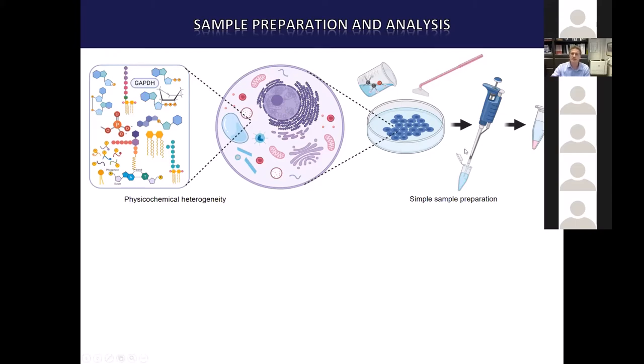And so to capture the endogenous profile, what we often do is pour liquid nitrogen onto our cells at the point we want to start to harvest them, to really cool those cells down rapidly. That really reduces the kinetics of the reactions that are taking place, so you really slow those down. You've essentially stopped them with liquid nitrogen. And then we do an extract, so a lysing of those cells, an extraction of the small molecules into the solvent as rapidly as possible. So we'd pour in liquid nitrogen, we'd pour on ethanol or methanol, and we'd disrupt the cells with a scraper, et cetera. Combining those two is very effective.